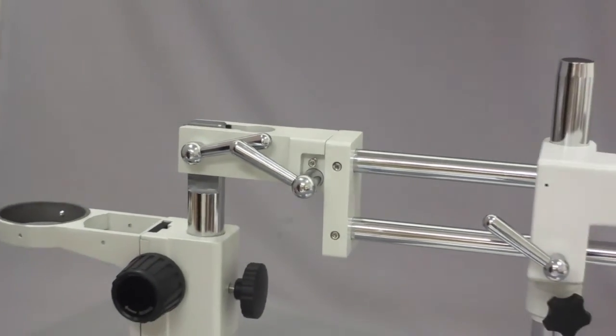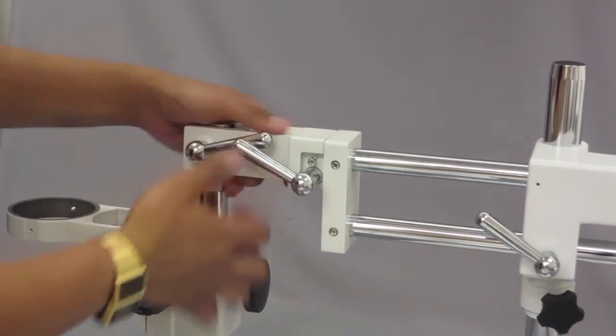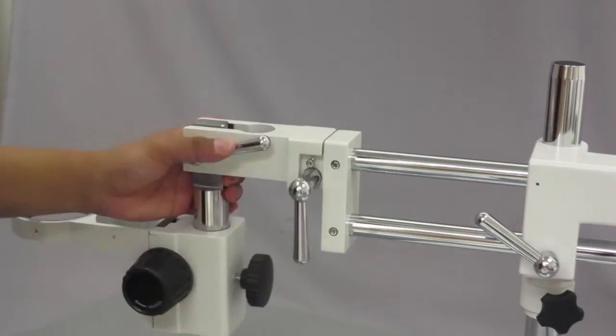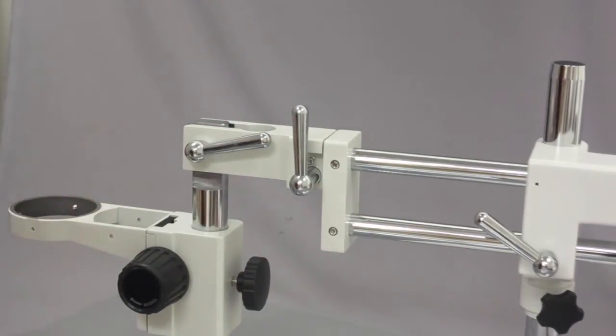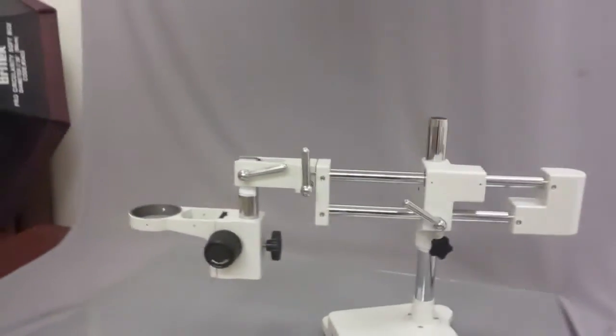Once that's tight it doesn't wobble left and right anymore. To demonstrate: if I unscrew this it loosens and becomes wobbly; tighten it and it stops. That's the double arm boom stand — let me show you the full functionality real quick.